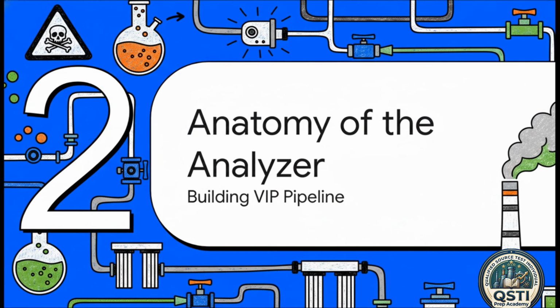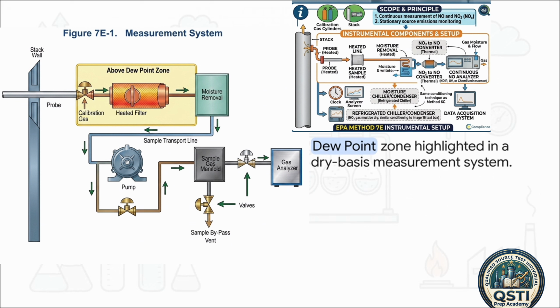Moving to Section 2, Anatomy of the Analyzer, Building the VIP Pipeline. Now that we know the stakes and just how hazardous this gas is, let's construct the specialized measurement system we need to safely transport and analyze the sample without accidentally altering its chemical makeup. A huge part of this VIP pipeline is the above dew point zone.